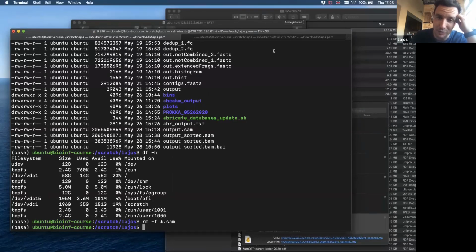I just have to spend probably an hour to set up the BAM view in that way that you really can see a lot of things. For example, you can see which read is paired with which one. I think it's only setting the view, but I don't want to spend the time with that now because we are already running out of time. But I will show it for next time.